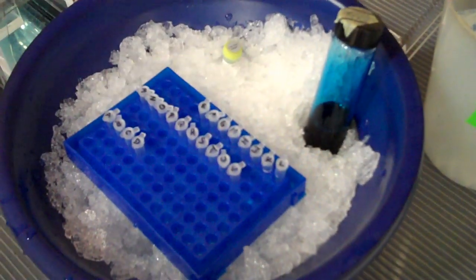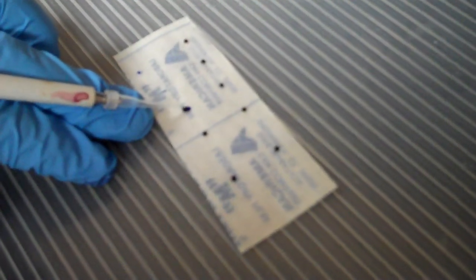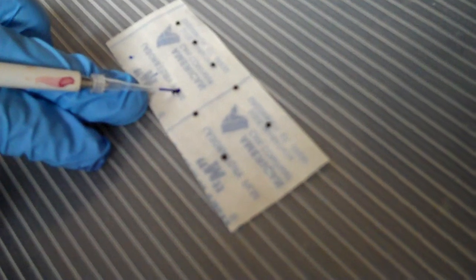Next, take two microliters of sample, load it into your pipette tip, and then mix it with the loading dye by pipetting.